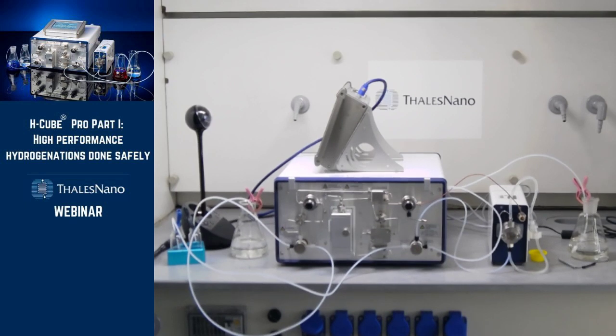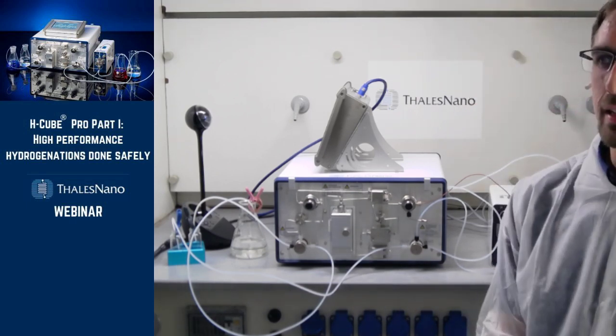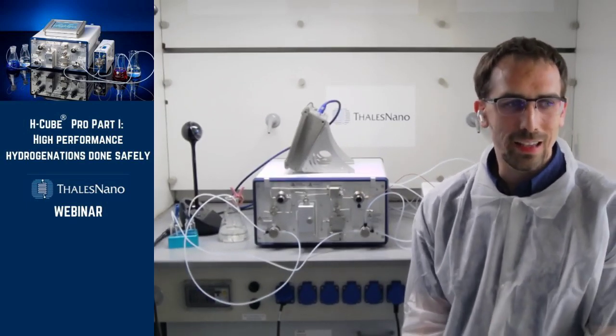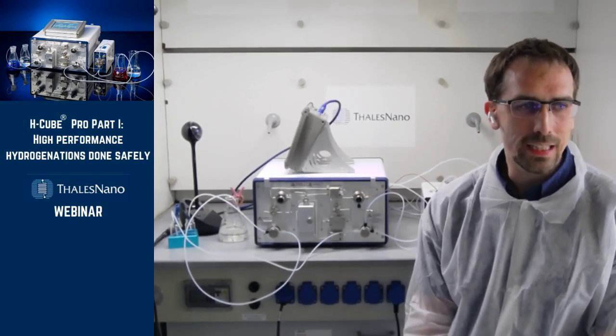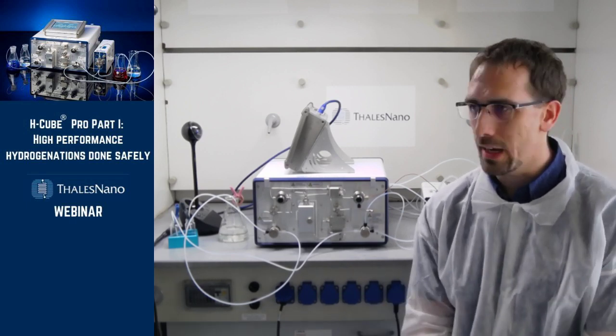So the first question which I see is, can we use H-Cube to perform general flow chemistry reactions? I mean, any reaction in clear solution form, can we replace batch with flow? Theoretically, the answer is yes, but I cannot say that you would be able to do this with all types of reactions.